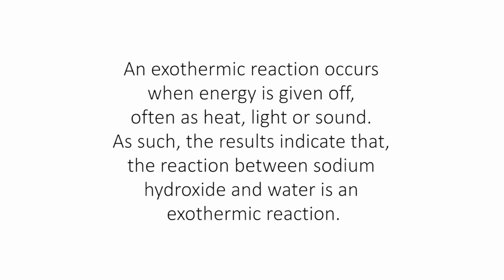An exothermic reaction occurs when energy is given off, often as heat, light, or sound. As such, the results indicate that the reaction between sodium hydroxide and water is an exothermic reaction.